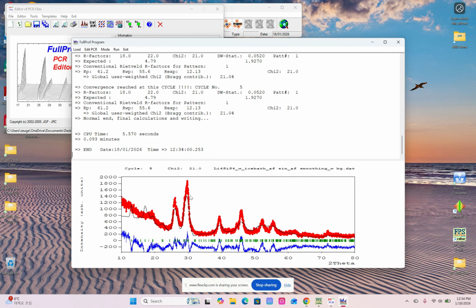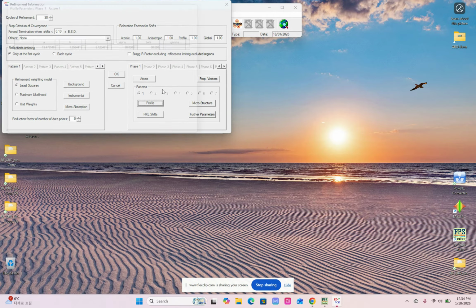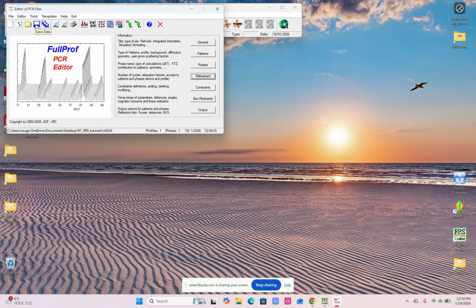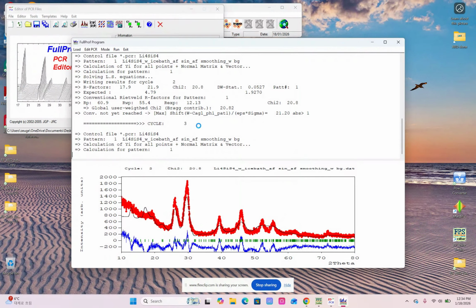So you really have to go millimeter by millimeter, or centimeter, whatever, closer with your calculation to the observed measured pattern. That's why it takes a long time, and that's also probably one reason why every parameter, especially in the beginning, needs to be refined one by one. Otherwise, you really risk, and it will happen, you can try it out, that your software collapses.